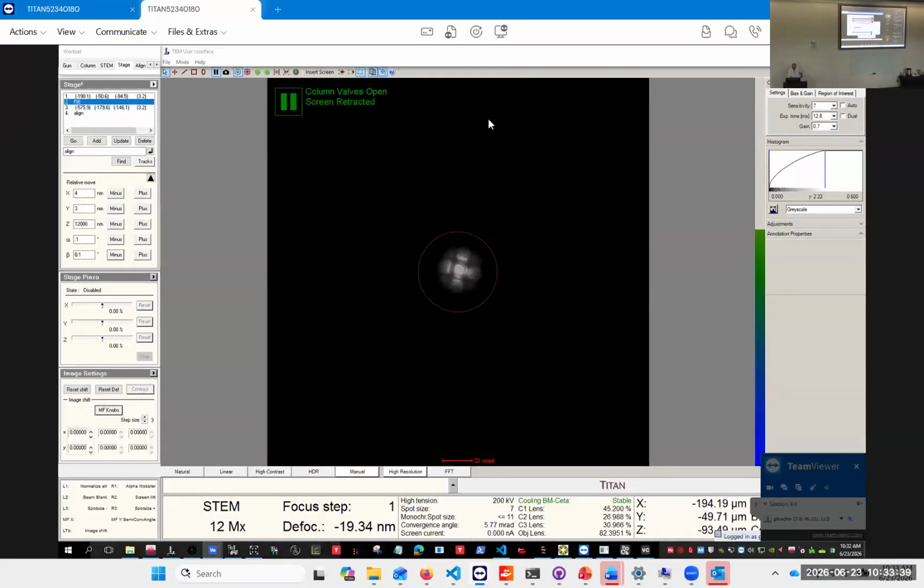We need, I did set on, yeah, okay. Okay, let's just try. We want to have set a little bit more to the, first we need a screen. Does it come?